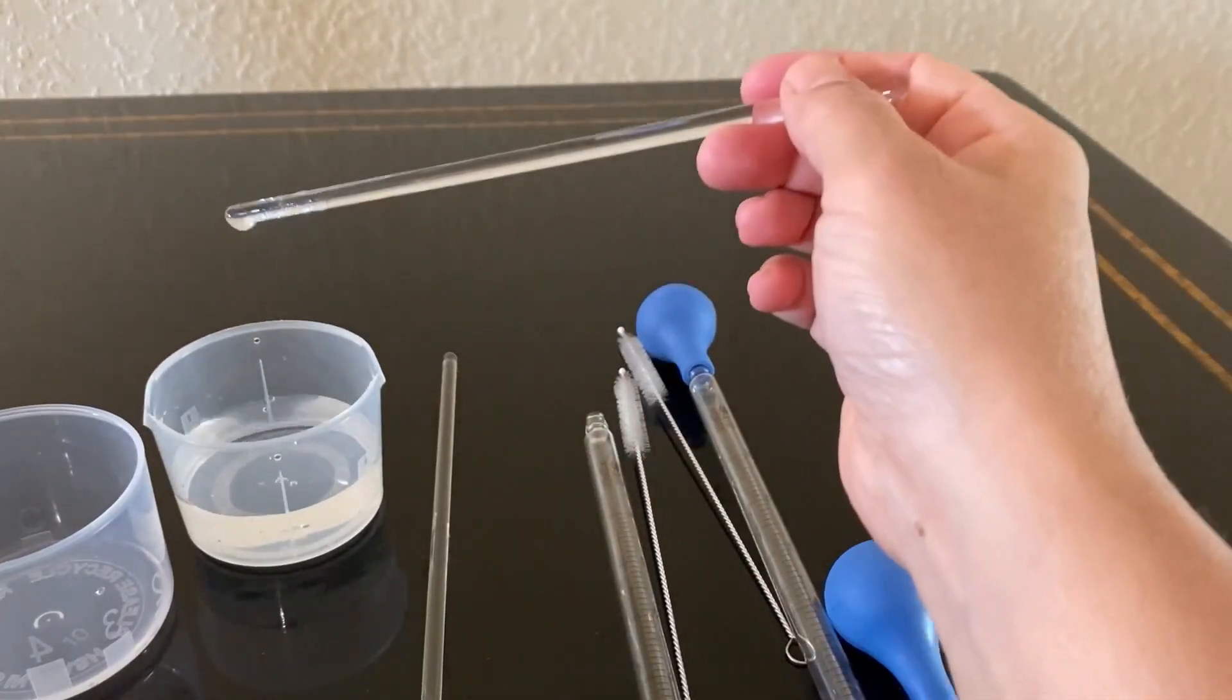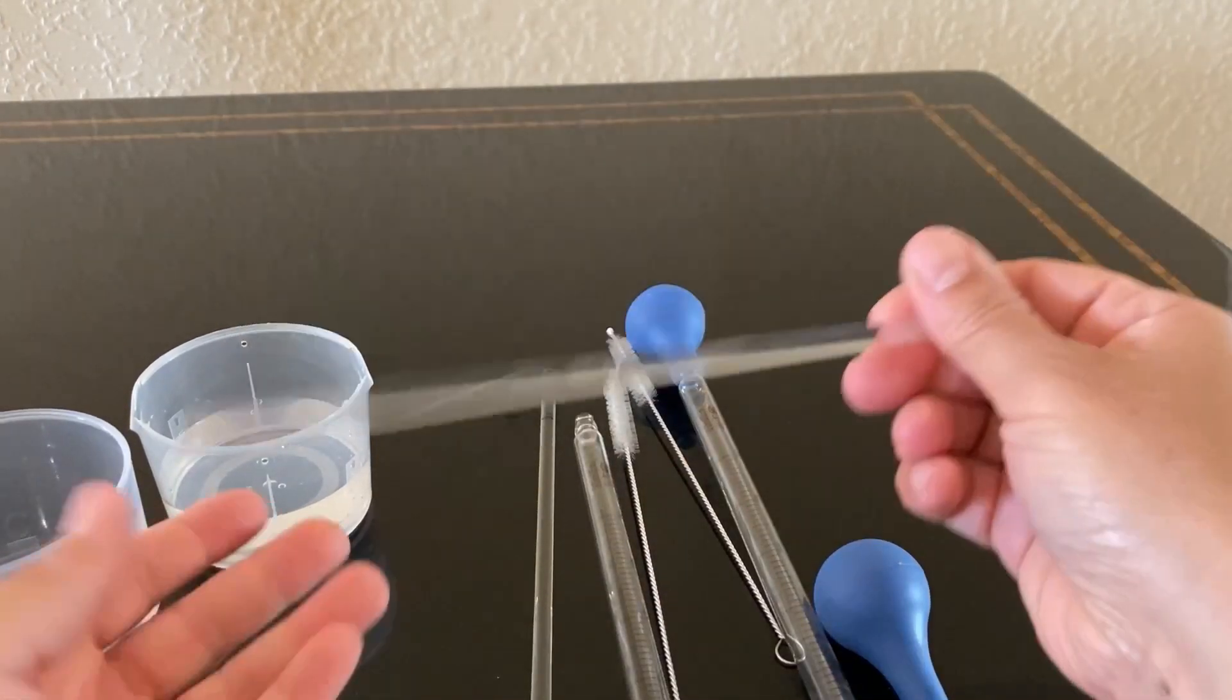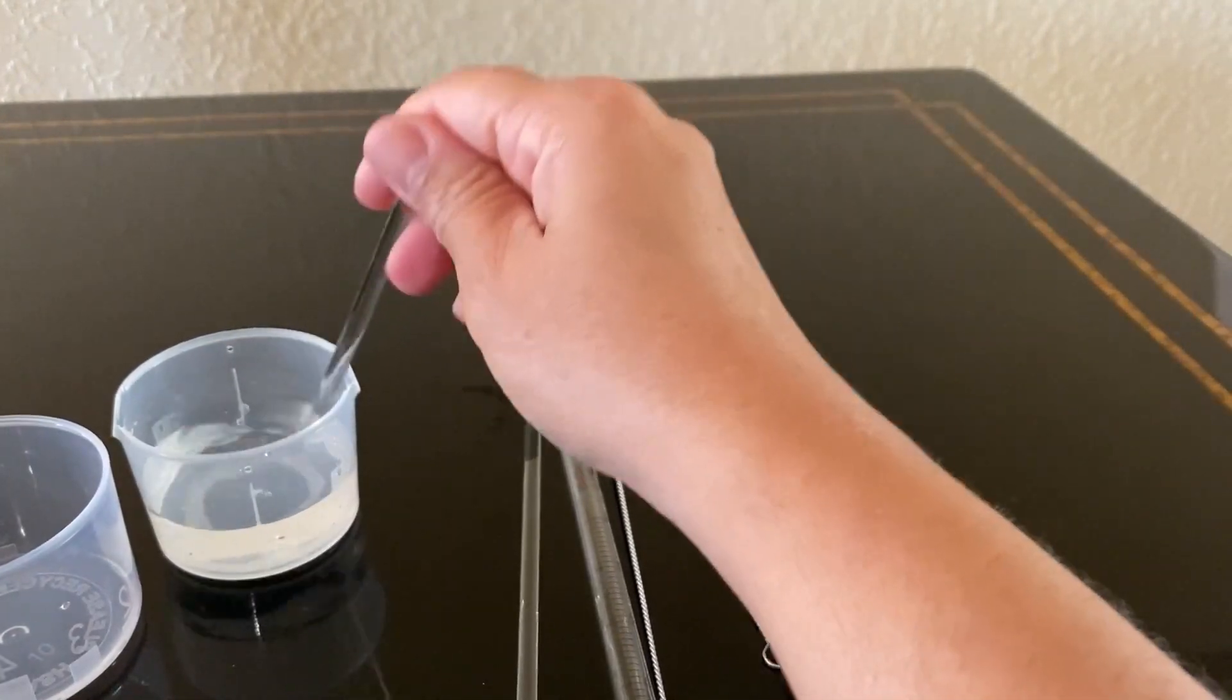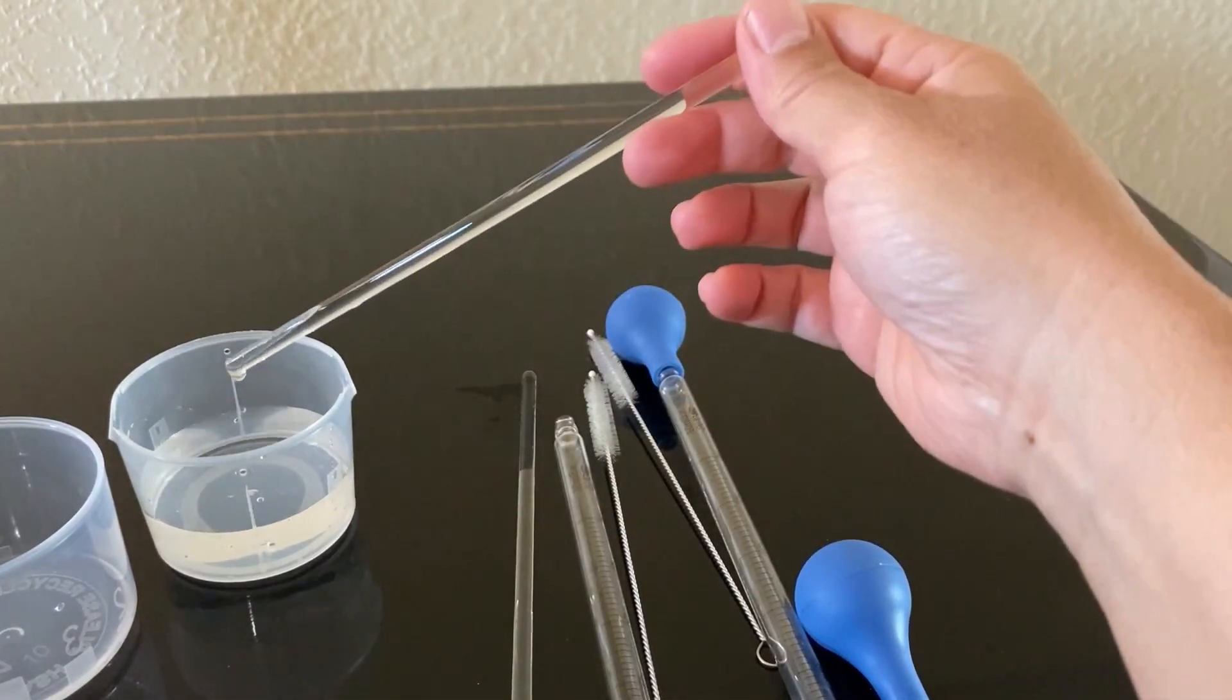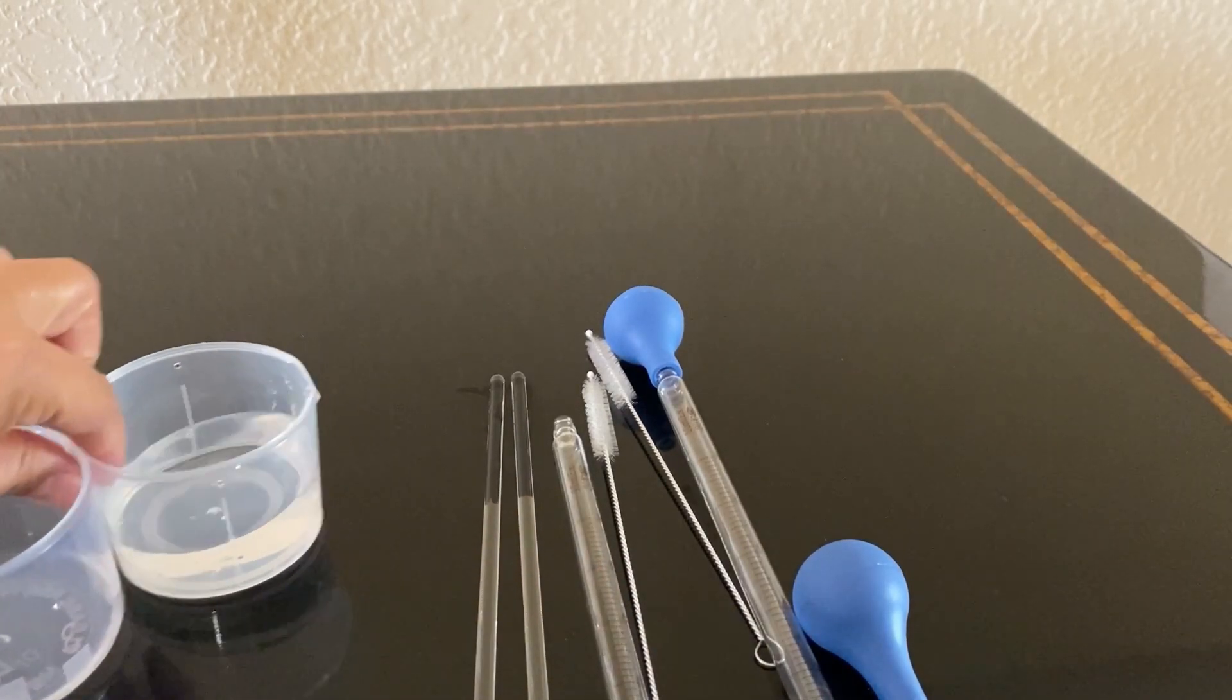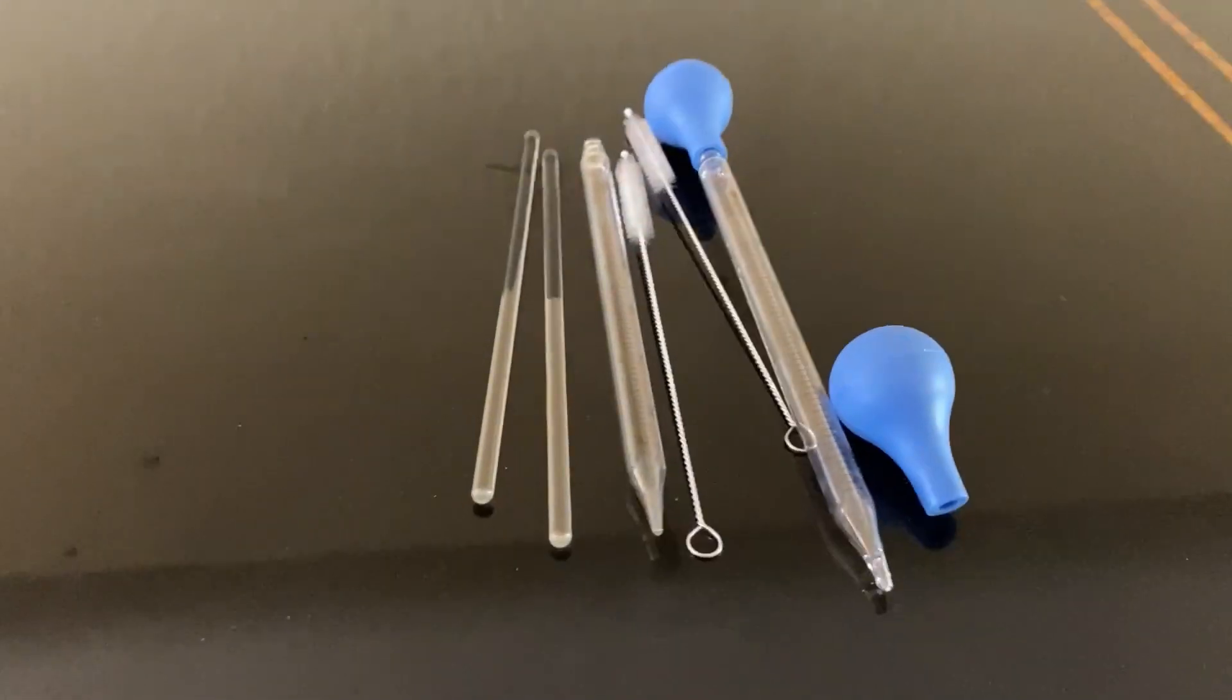This glass pipette dropper set is extremely well made from high-quality material. It's a versatile solution for transferring and measuring liquids. The clear markings, leak-proof design, and cleaning brush make it easy and a valuable tool for anyone who works with essential oils or other precise liquid measurements. Hope you like my review, thank you.